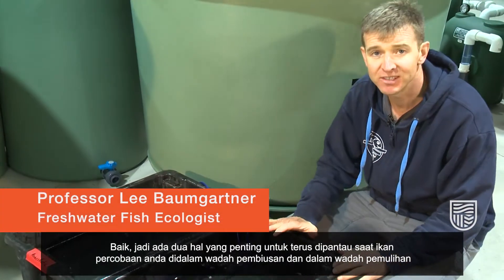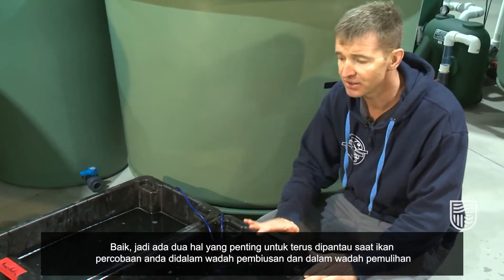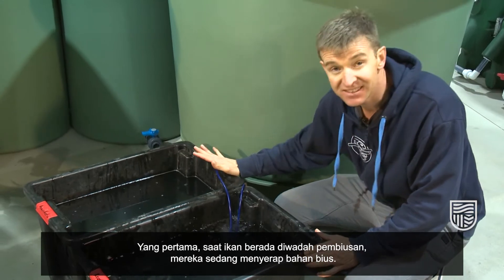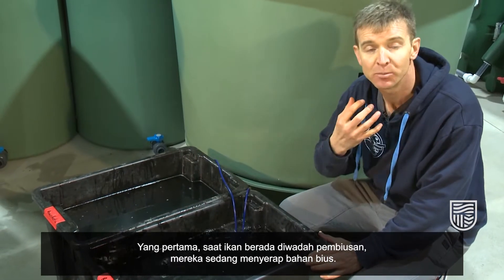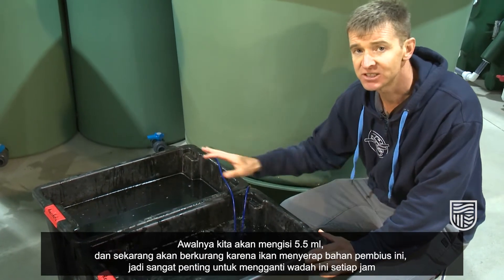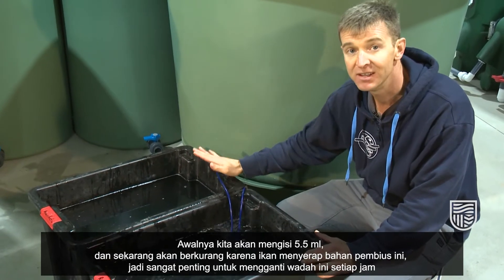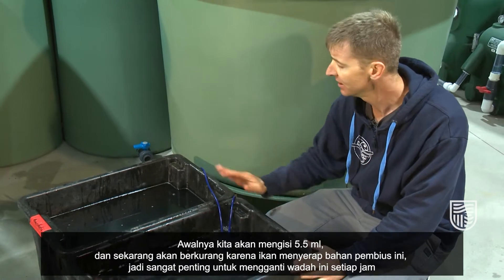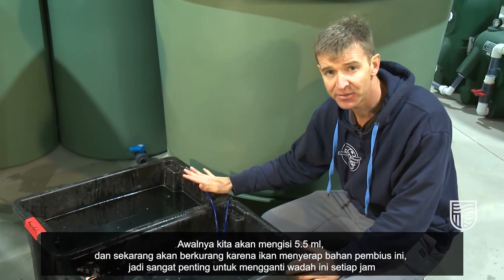There are two critical things to monitor while fish are in the anesthetic bath and in the recovery tub. As fish sit in the anesthetic bath, they're actually absorbing some of the anesthetic. So initially we put in 5.5 ml, but now there would be less because some of the fish absorb that anesthetic. It's important to change this bath every hour.